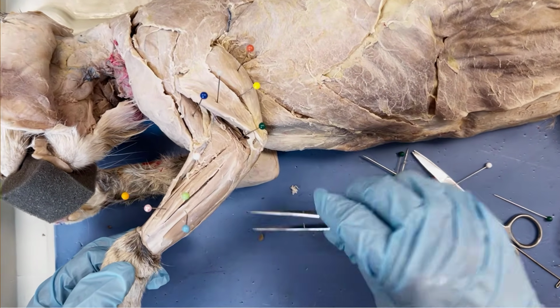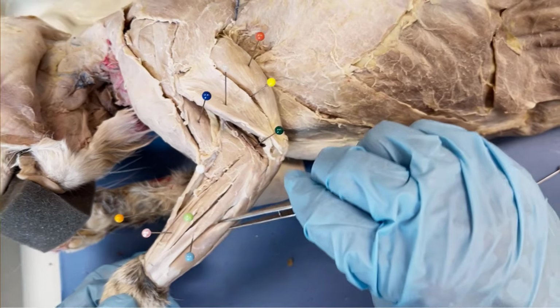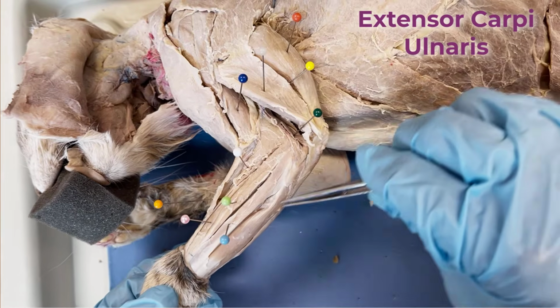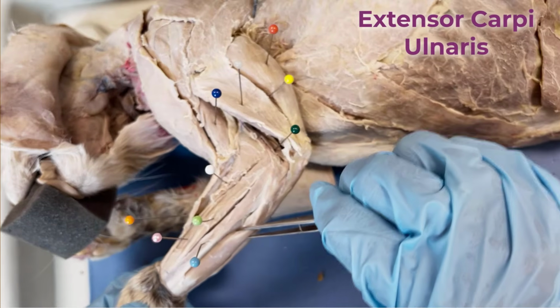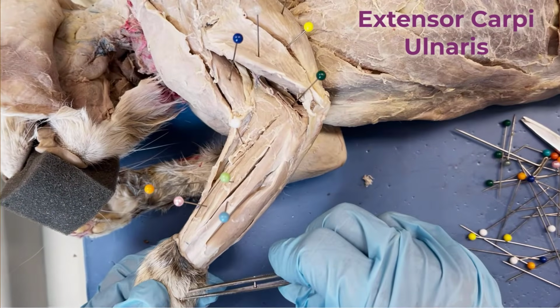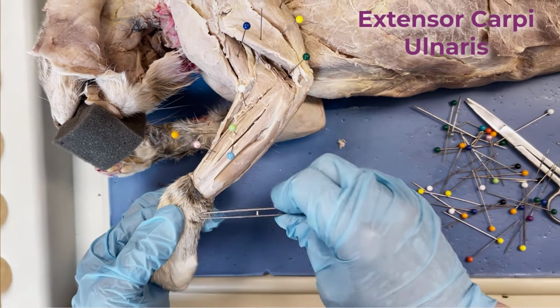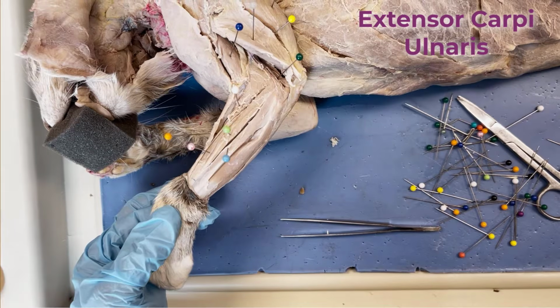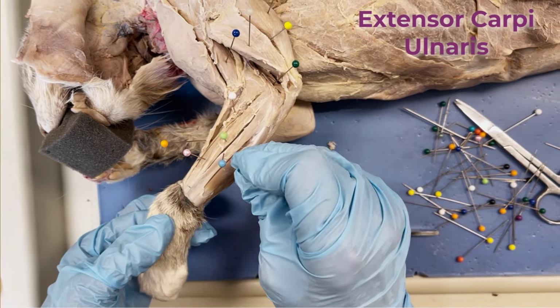And then finally, down here is our extensor carpi ulnaris. So now we're down near the ulna. So extensor carpi ulnaris, and that's going to be pulling on the more lateral side of the paw there to get it to extend. We'll use this color.